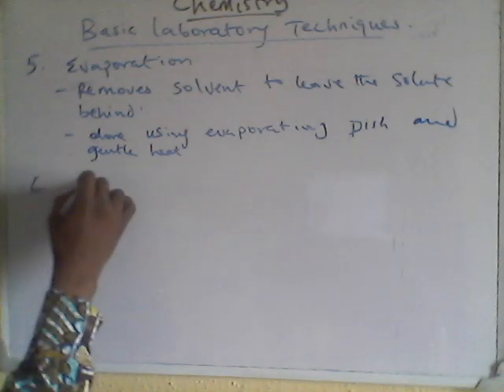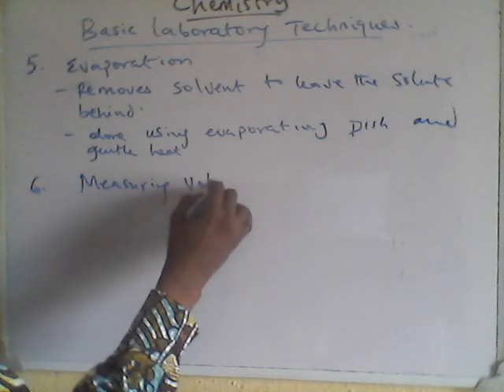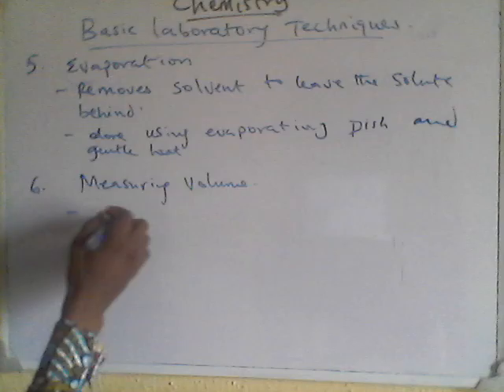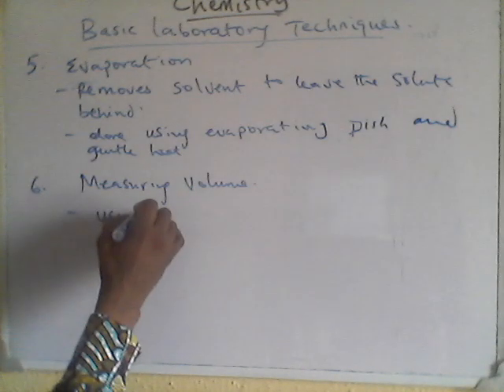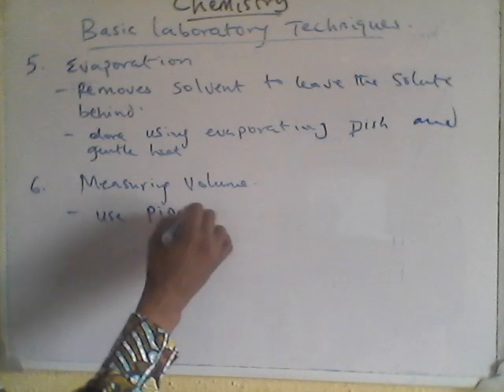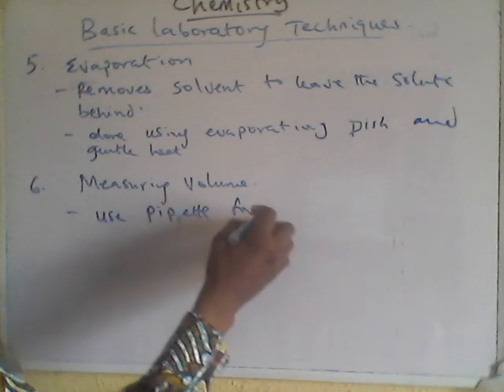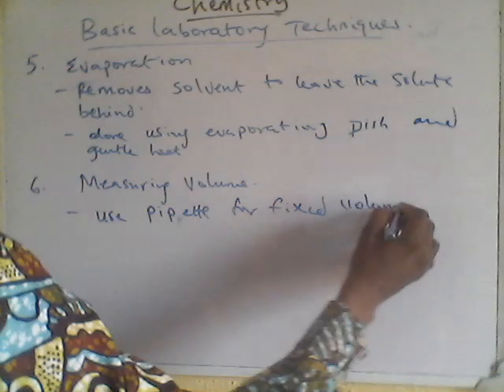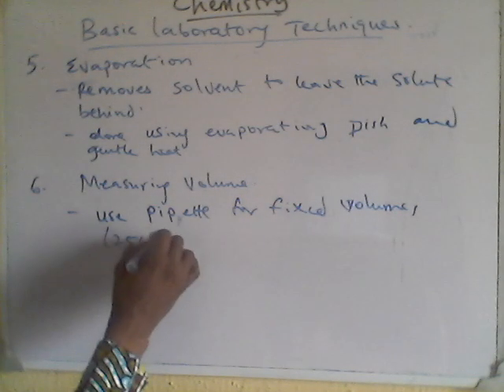If you are measuring volume, what are we using? We use apparatus like pipettes. Pipettes give you fixed volume, like the one that we say 25 cm cube.